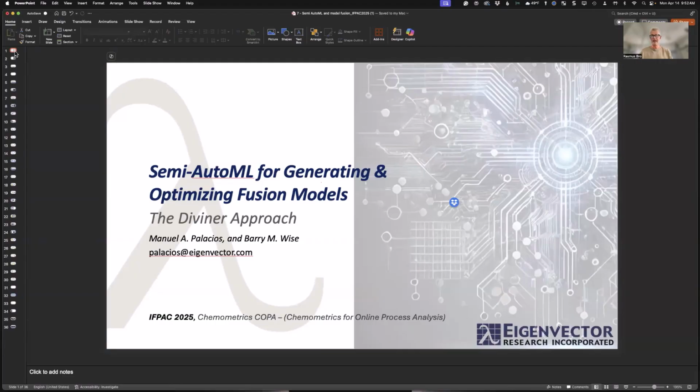Hi, I have a question. Well, first of all, thank you for the presentation. I think it's a really interesting tool because I also have a similar tool that I presented in this Monday's webinars like a year ago, if you remember. It's for preprocessing, just the preprocessing part. But my question related to that: have you considered any indicators or any way of screening preprocessing methods, to not try all the models?